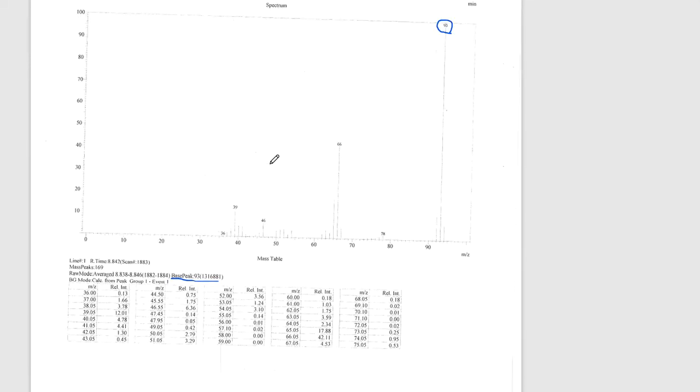All right. The next thing is the M peak. Now, keep in mind the M peak is the formula weight of the compound. And it is okay, like we've talked about in the lecture videos, for the M peak to be the base peak. Sometimes that just happens, and that means that the molecule does not prefer to fragment. When it goes into the ionization source, it prefers to stay together, and it's really hard to punch it.